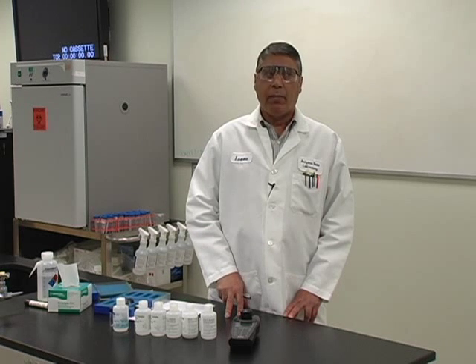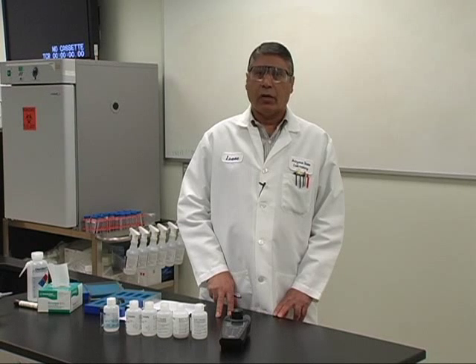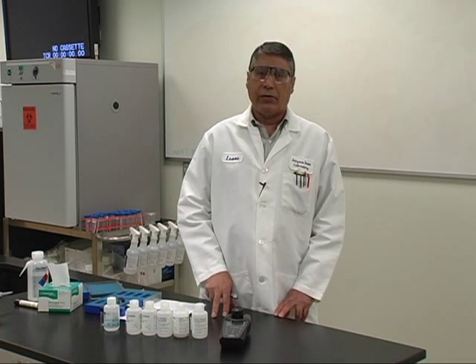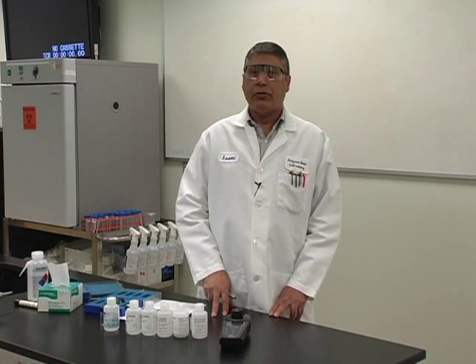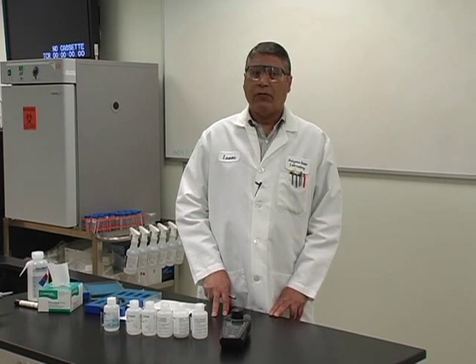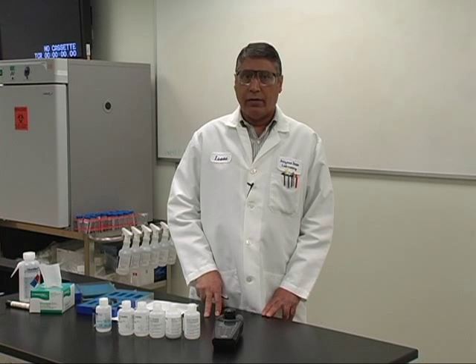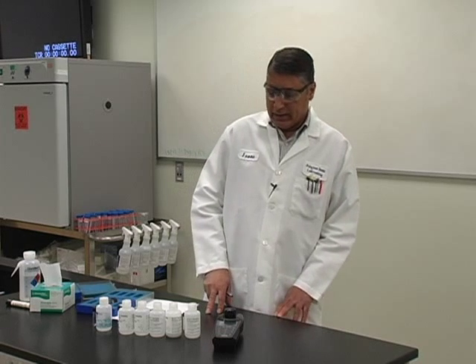Both the standard method and the EPA method require that you maintain and calibrate the meter according to the manufacturer's documentation. This is the reason why you are required to have signed off that you have read the manufacturer's documentation for your training purposes. Standard method 2130B requires that you calibrate the meter with at least one standard daily and within the range of use. That means if your permit has a two NTU maximum for a 24-hour period and a five NTU single reading, then that standard has to be within one and five NTU units.